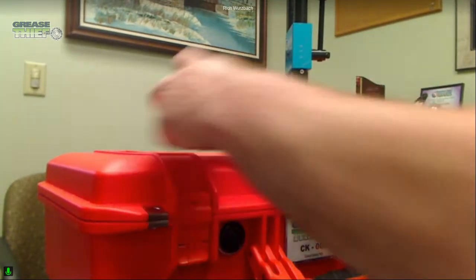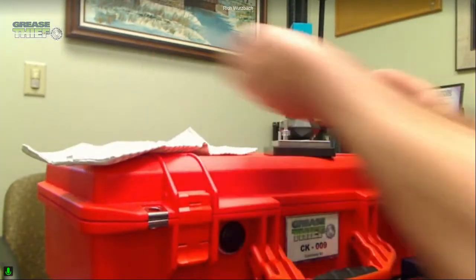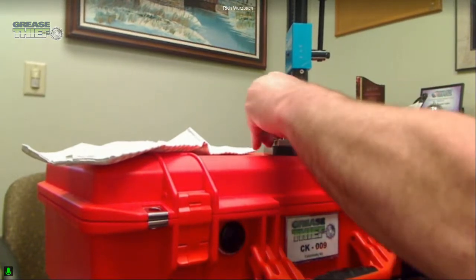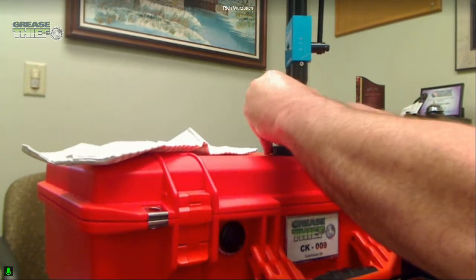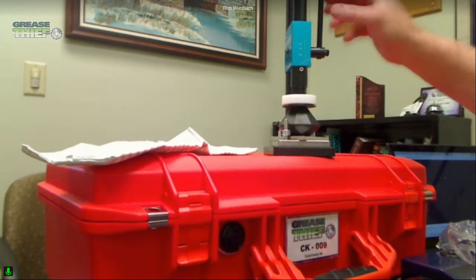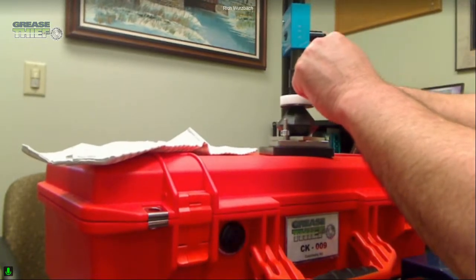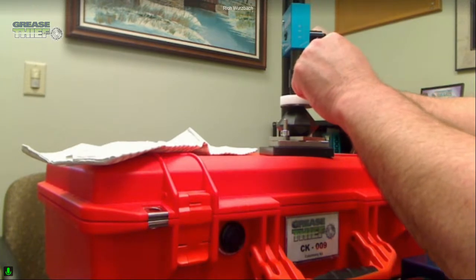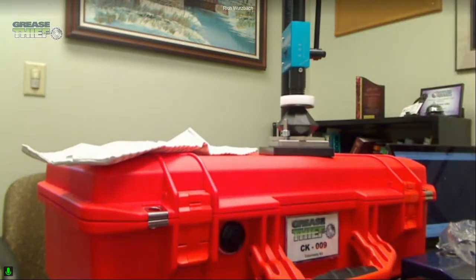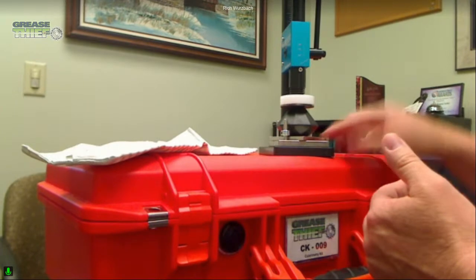And then you have your spacers, and there's a bit of a setup here when you get started. This one's new right out of the box. So we go through that setup process. But there's my zero spacer, and that's going to allow me to set this up so that when I use the other 3 spacers that are here, I can do that kind of thick film arrangement that I talked about, or narrowing it down for the darker greases by changing the spacers.